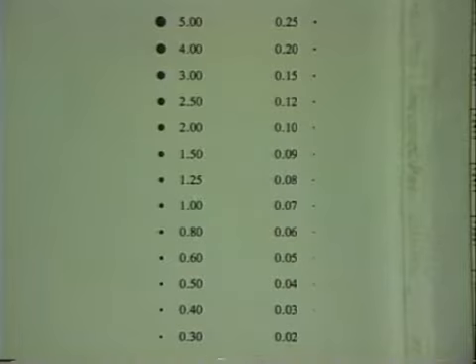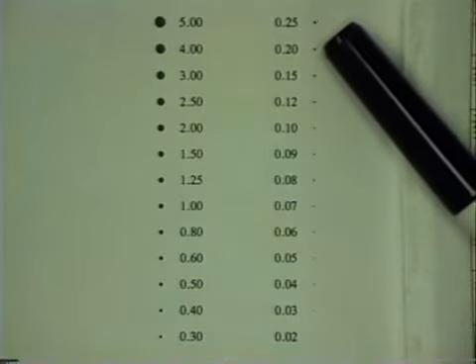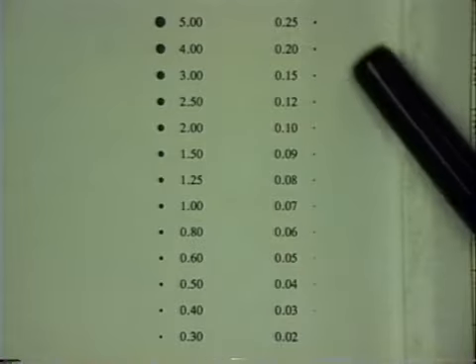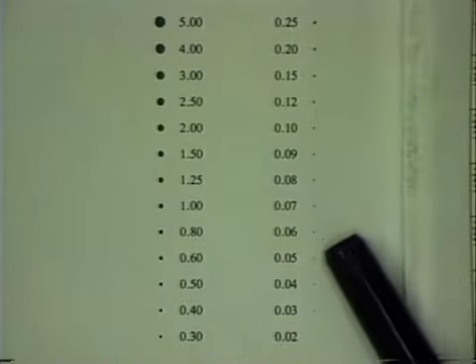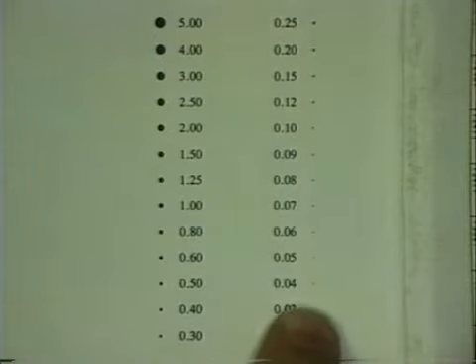We're starting down here at 0.25, and I know that what you can see here is a function of many things, including the zoom that I've got on here, but if you start going down, you're getting to small dots, and you can almost see this 0.04 dot right here. Just barely see it.